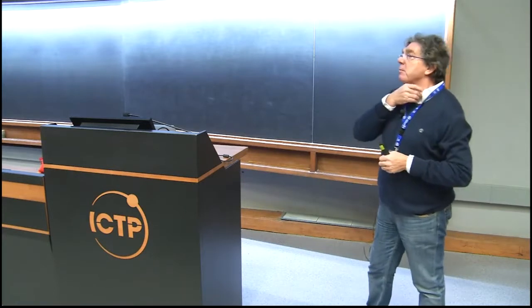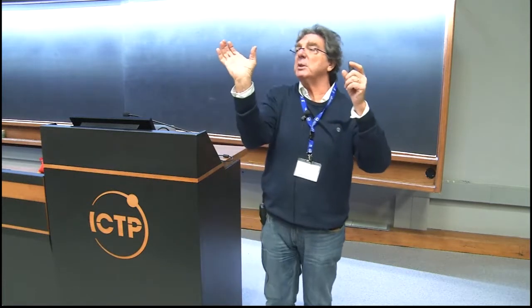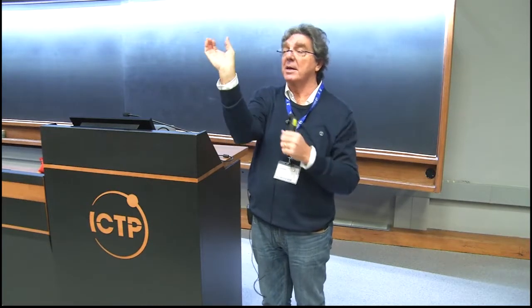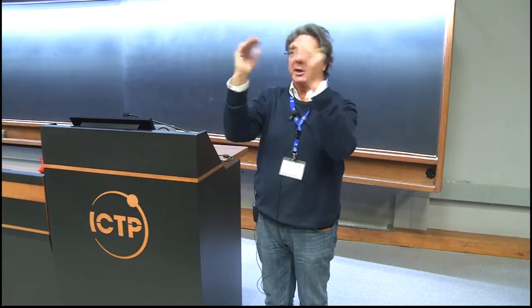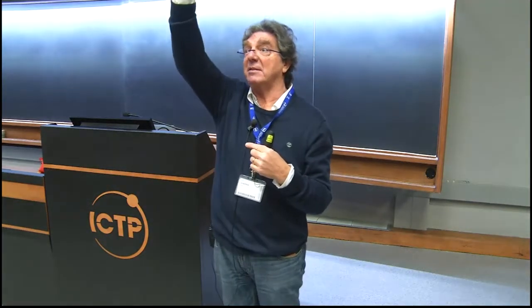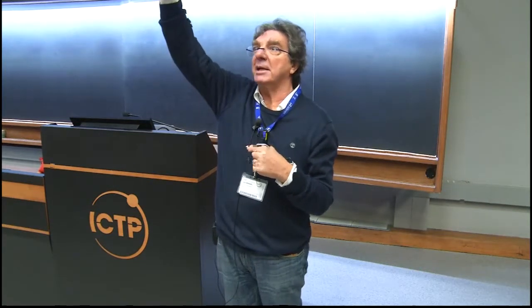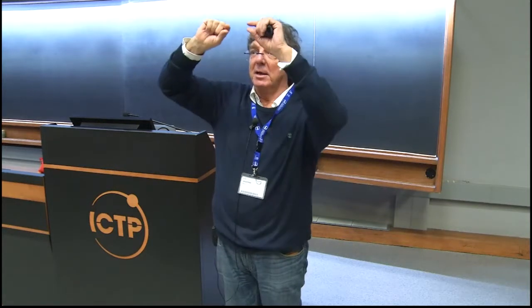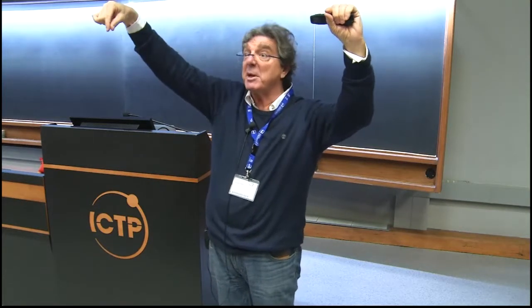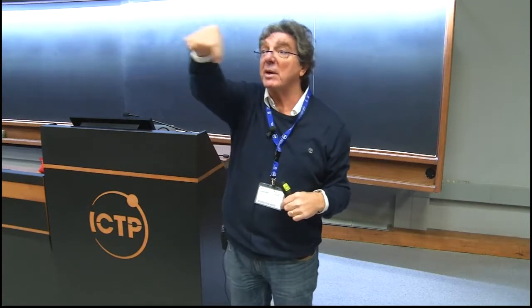So now, since you already discussed about microscopy, you can assume that you have a three-dimensional gel, fluorescent. Within this gel, the view that you have here is z-axis, that is the axis of propagation of light, and x or y. And now I'm shining light in the gel in a very small region. So I put my focus of my lens in a very small region in the three-dimensional object. I shine light until I consume all the fluorescent molecules, so until they all photobleach.